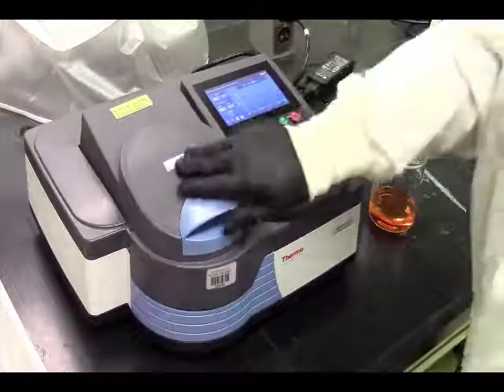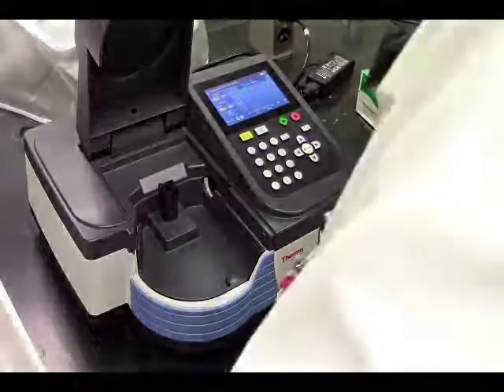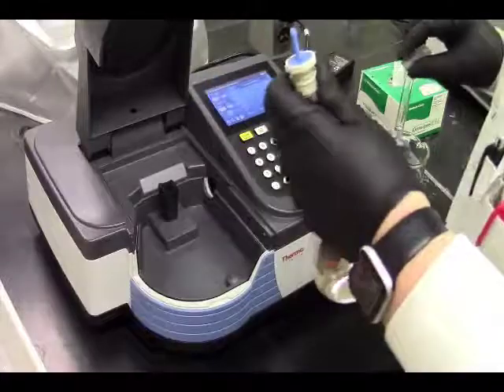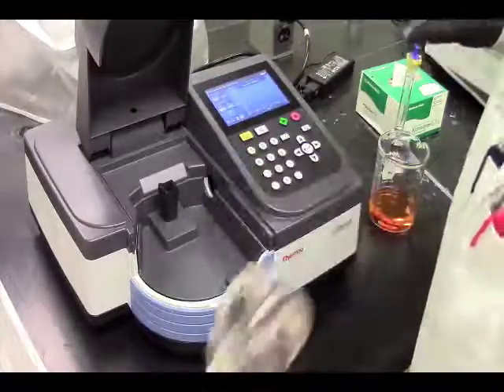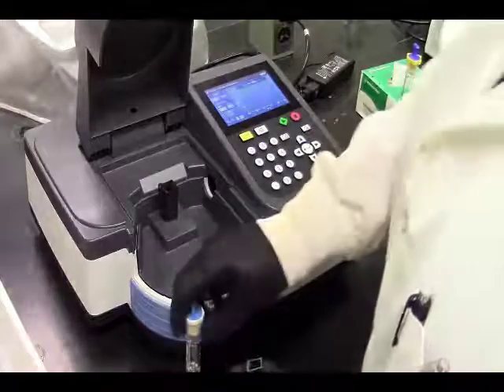And it is now blanked. We're going to remove, dump, take our least concentrated. Has it been 10 minutes? For this one? Yeah. It has been. No. It's been close. Should we come back to? We're going to come back to that one just to make sure.